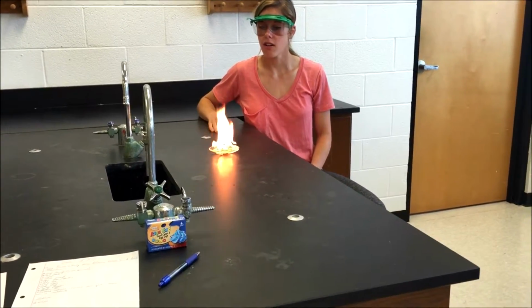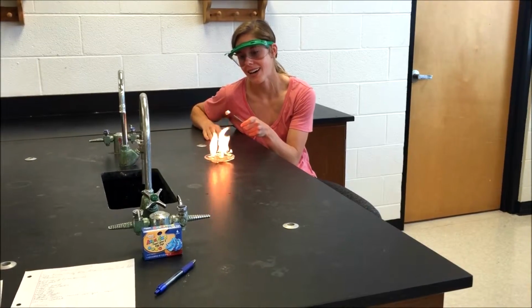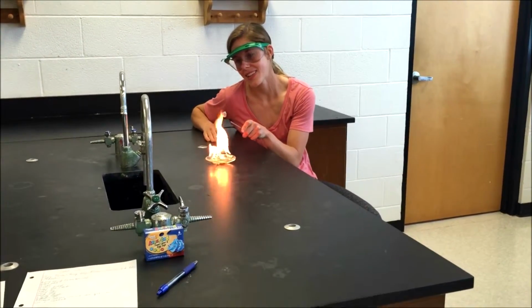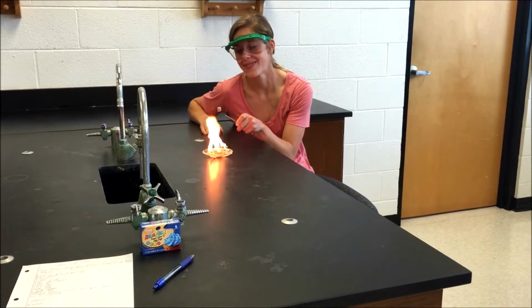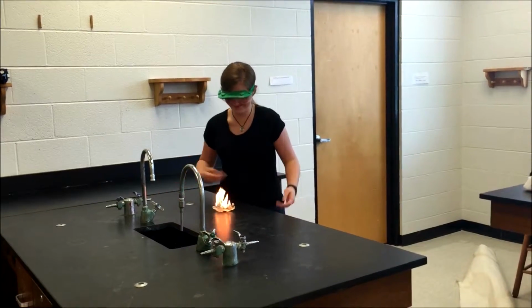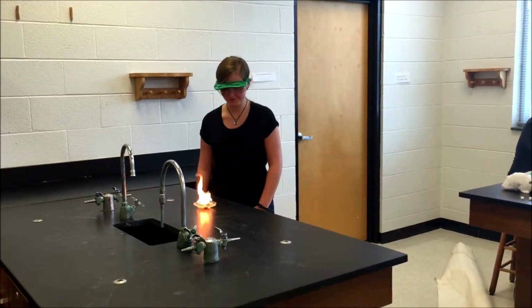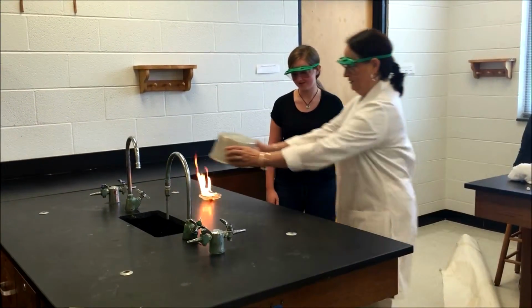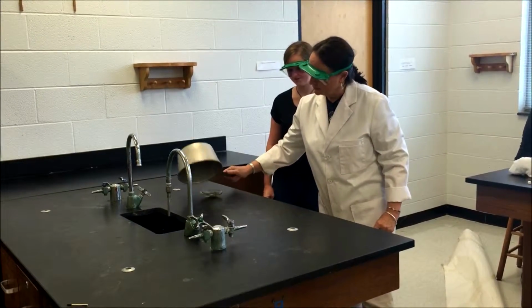We see here the chemist is in quite a predicament. This is an unexpected fire. Instead of addressing the problem and notifying the teacher, she proceeds to make s'mores. Instead of making a tasty treat in an emergency, notify the teacher and take the necessary steps to address the problem with help from a trained professional, as shown by this intelligent chemist.